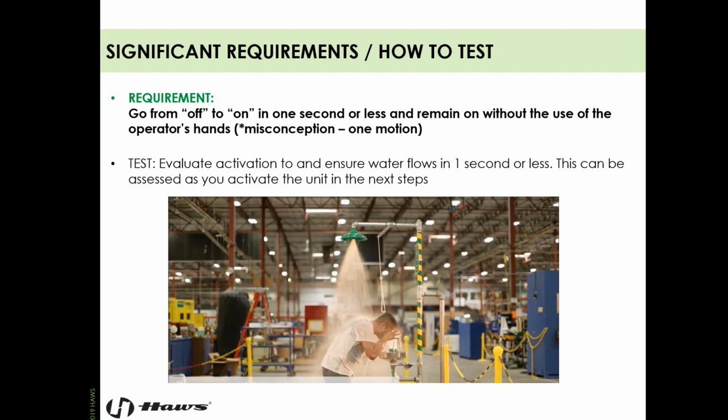Now, the reason that this is an issue is because you cannot hold that equipment open while keeping your eyelids open with your fingers, removing clothing, and dealing with other emergencies that might arise, right? And washing your body. So it needs to remain on indefinitely until you close it manually, okay? So no self-closing valves, very important.